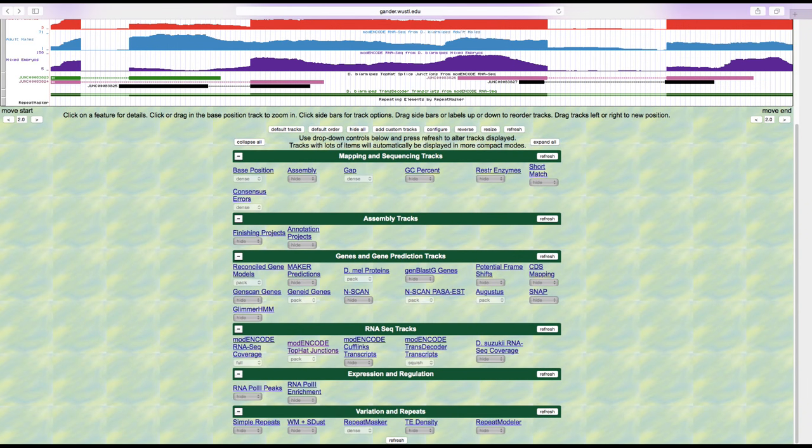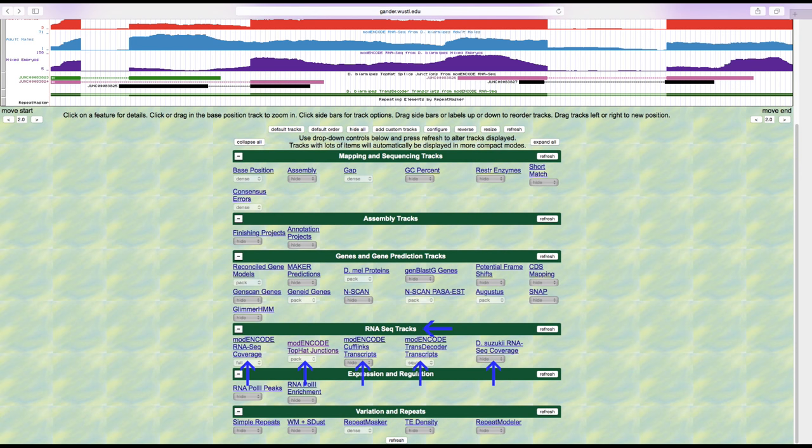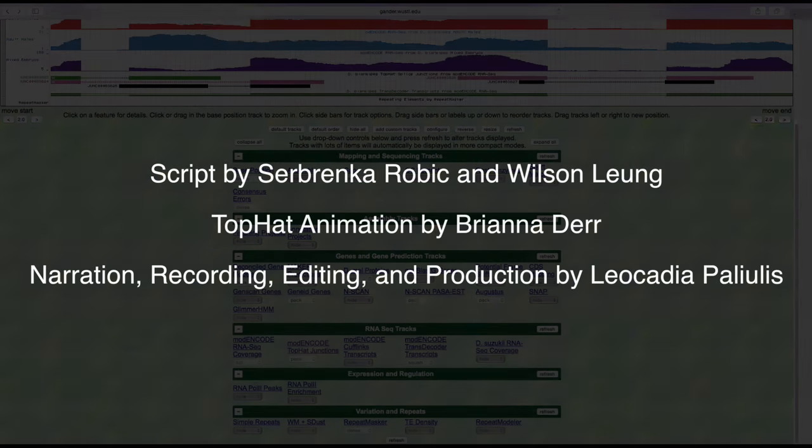Several other evidence tracks are available under the RNA-seq track section. You may click on the track title link above the display mode drop-down list to learn more about how that evidence track was created and the display convention used by that particular track.